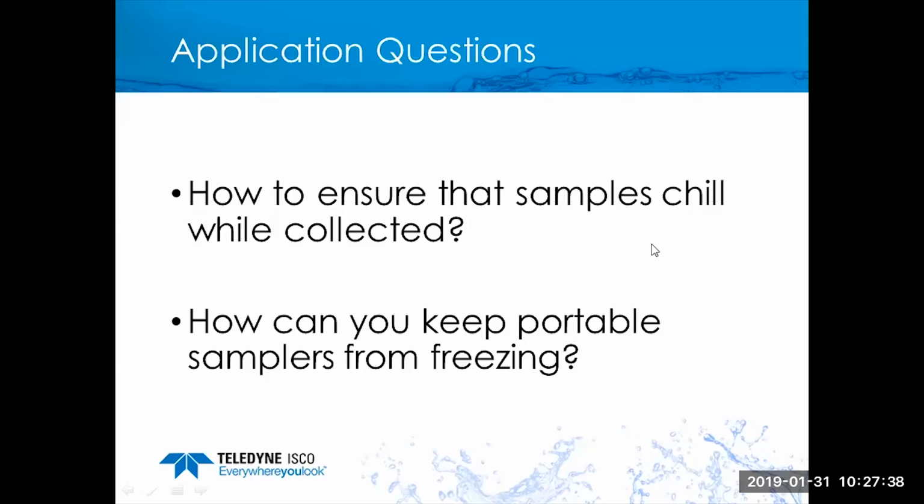Not to mention that having a sampler in an enclosure adds a level of security to it, because if you have a sampler out in the open, either somebody walking by, there's the risk of them tampering with it, or even wildlife sometimes can knock a sampler over because they can be shocked, if you will, when that noise kicks off. So I would recommend, if you are deploying in an environment that's outdoor above ground, having an enclosure.